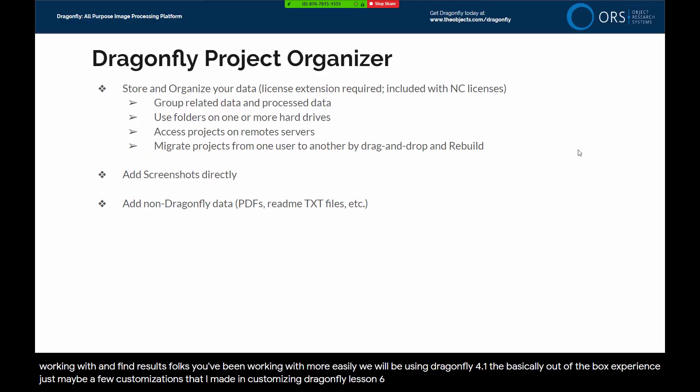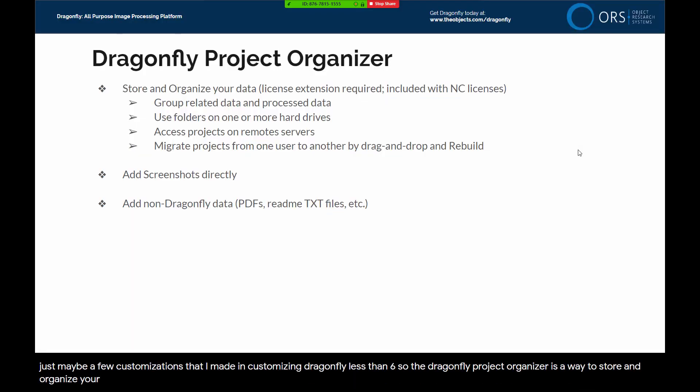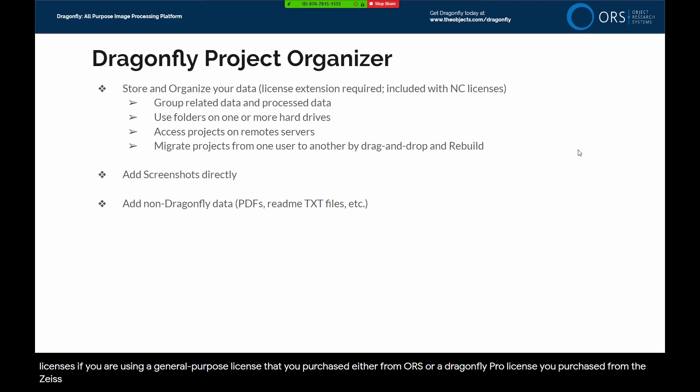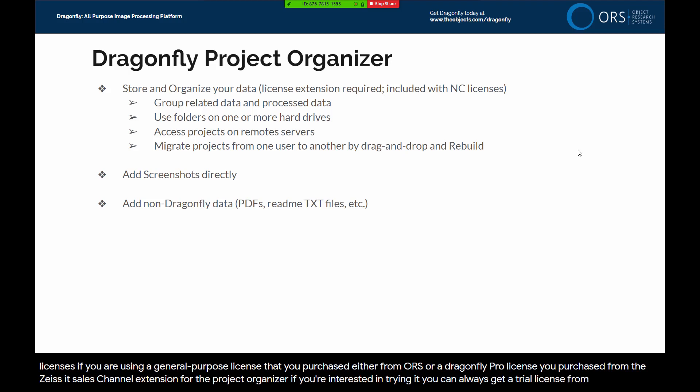The Dragonfly Project Organizer is a way to store and organize your data. There is a specific license extension required to have the organizer, but that license is included with our non-commercial licenses. If you are using a general purpose license that you purchased, either from ORS or a Dragonfly Pro license you purchased from the Zeiss sales channel, you will need to purchase the extension. If you're interested in trying it, you can always get a trial license from us.